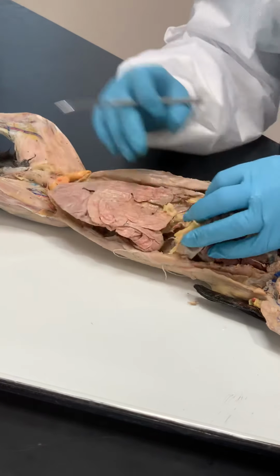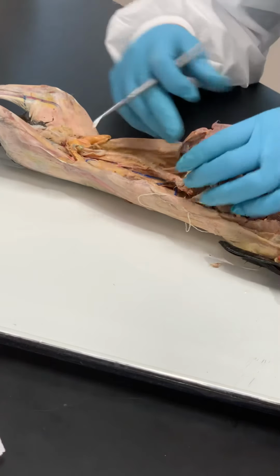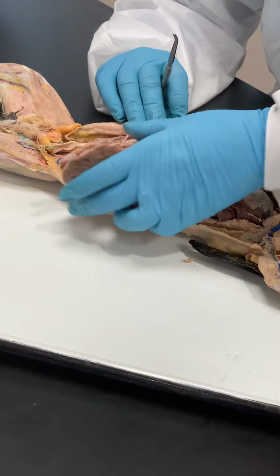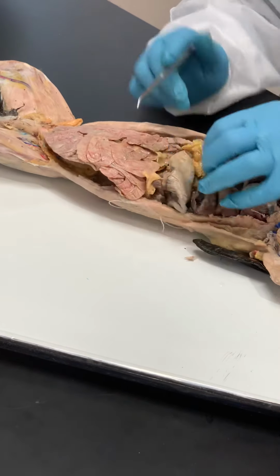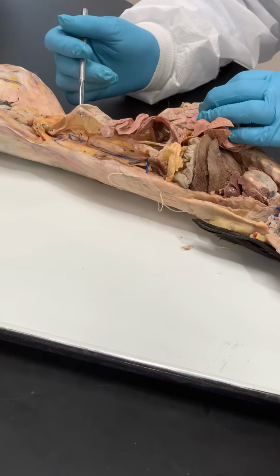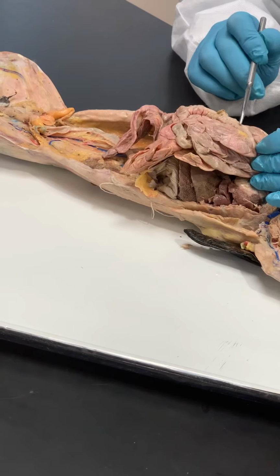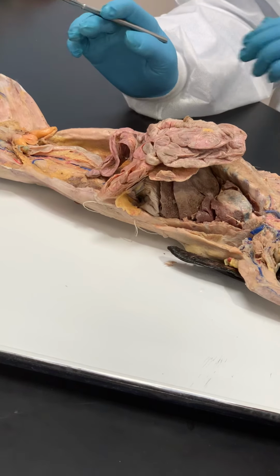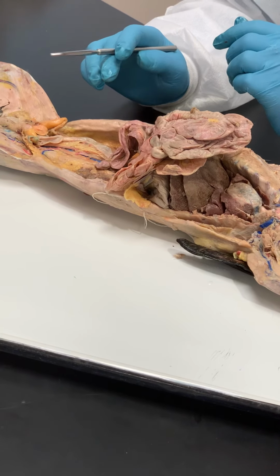It's no problem. Okay? If I was to separate all this, which I usually end up ripping it, we could lay it all out on the bench. Maybe I'll get that done for the next time we take a look at this when I get a chance. So what I would do is say, okay, stomach, oh, here's the small intestine. Oh, here's the large intestine. Oh, this thing, perforated looking, that's the cecum, and I would move on. That's all I would do with that. I wouldn't get bent out of shape any more than that about it.